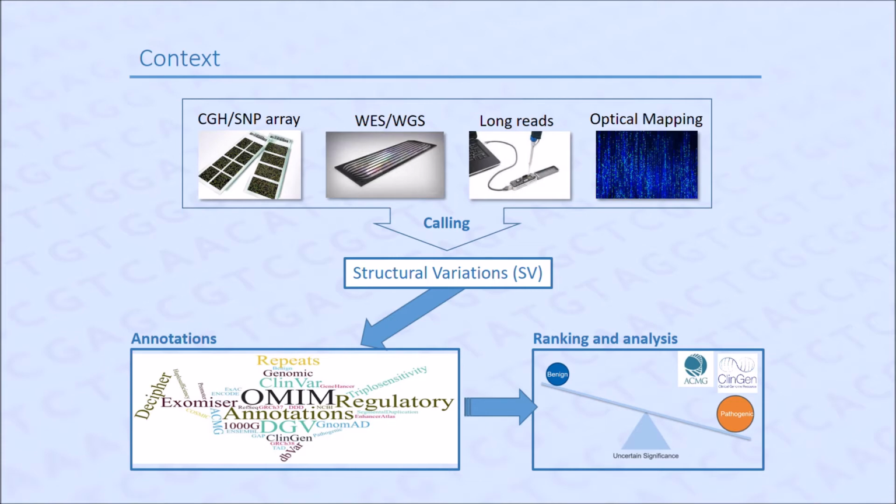Human geneticists generate large amounts of genomic data, including millions of small variants, but also thousands of SV, mainly from array-based techniques and next-generation sequencing. Relevant annotation are available from many well-known databases like OMIM, DGV, ClinGen, gnomAD, and some joint consensus recommendations of ACMG and ClinGen was published in 2020 for the interpretation and reporting of SV.